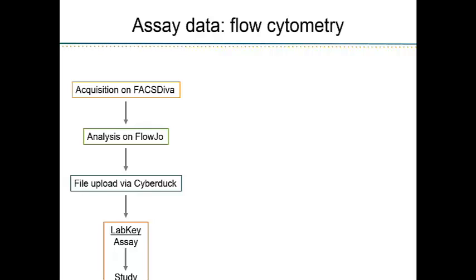We acquire it on the software that's attached to the machine. We analyze it on FlowJo. We upload it via a free FTP client, CyberDuck. And once it's in LabKey, we still have to do quite a lot of work as far as organizing the files and pushing it into the study.